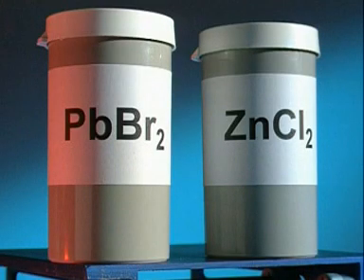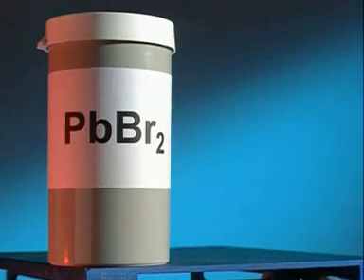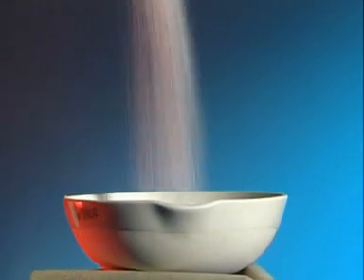Change the compound from lead bromide to zinc chloride and the products of electrolysis will be different. What would you expect to see happening when electricity is passed through molten zinc chloride?